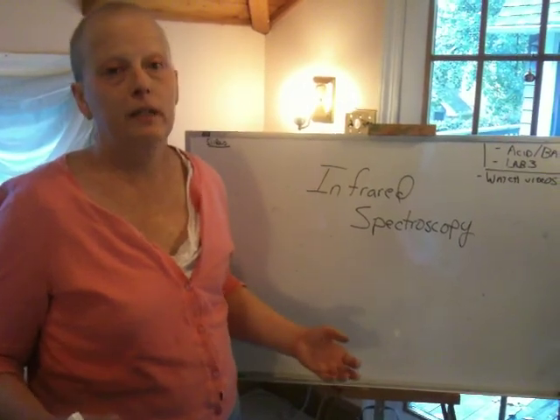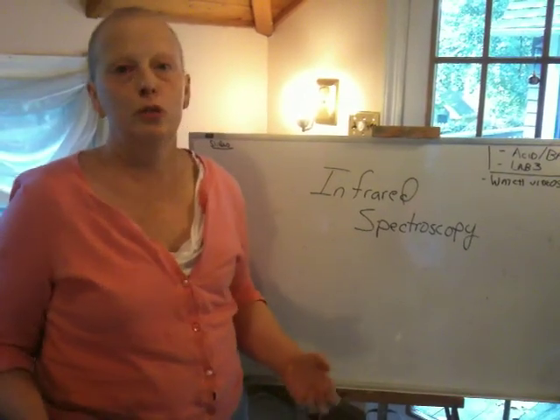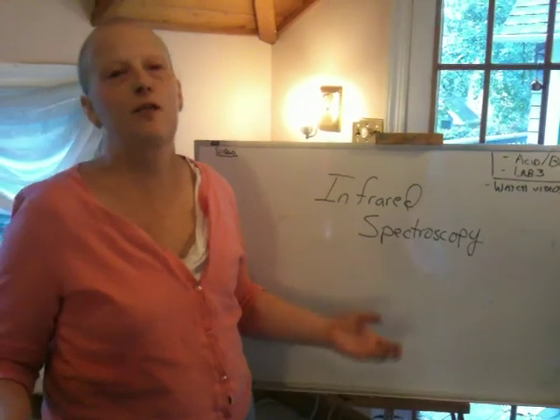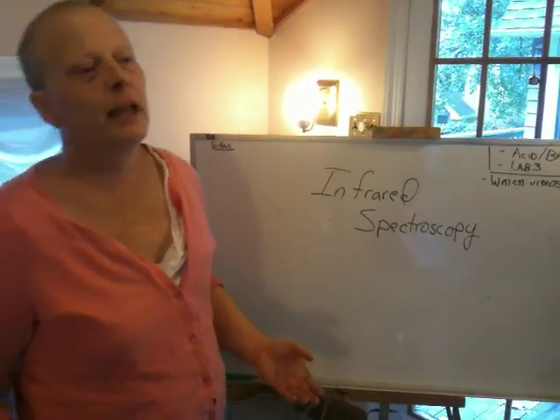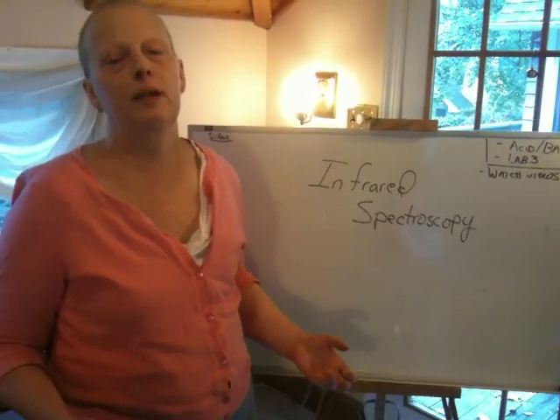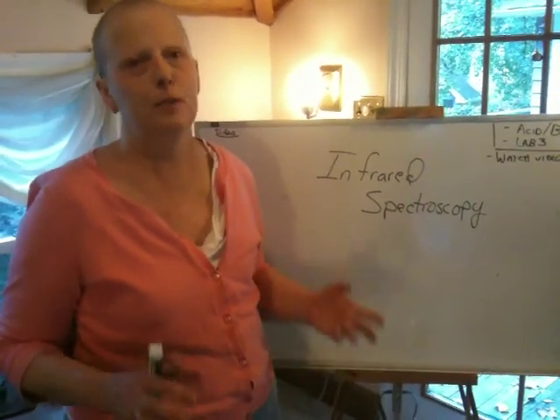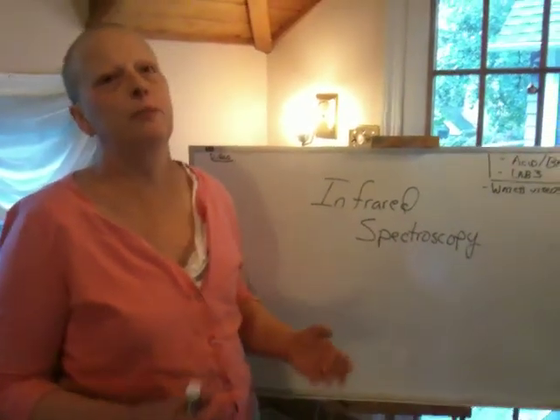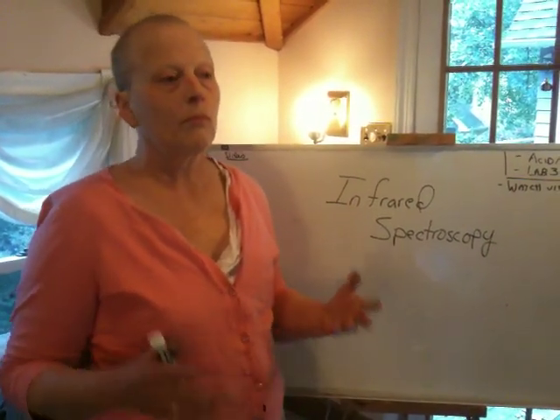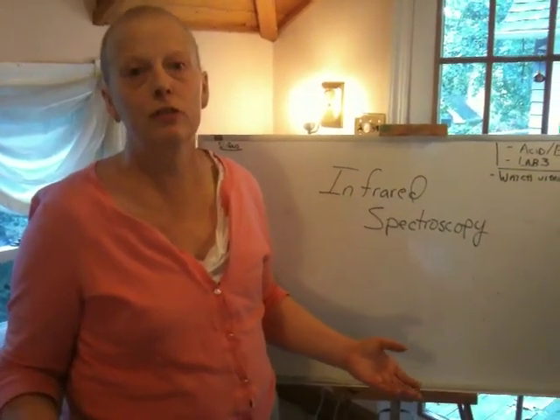And then what you did was you took the sample and put it into the Spec 20, and you were told to pass a certain wavelength of light through the sample. Perhaps it was 605 nanometers, something like that. And you measured how much light, or how much electromagnetic radiation, was absorbed. And I believe you were probably studying the Beer-Lambert law. And maybe that comes back to you. Remember that there was a relationship between how much light was absorbed and the concentration of the solution. And you can actually figure out the concentration of a solution that way.